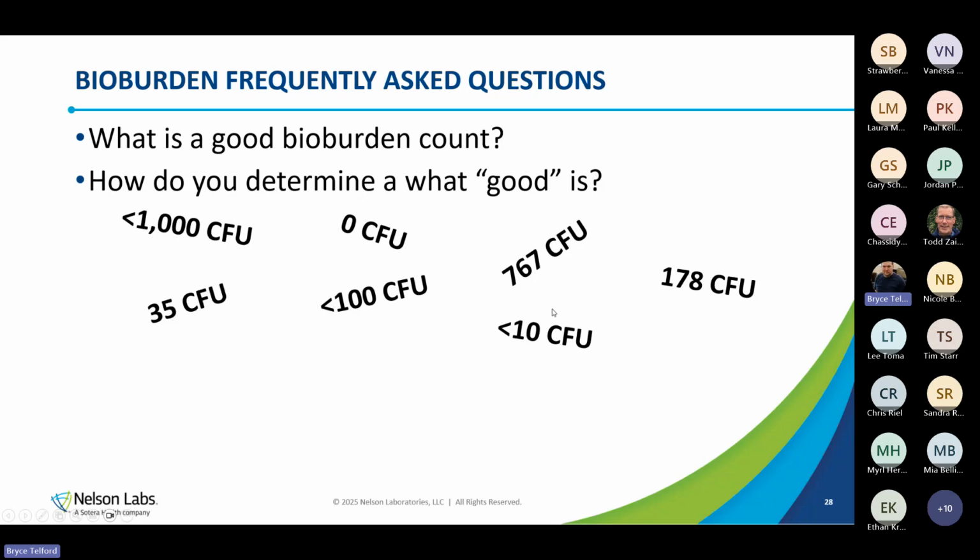The thing is, us as the lab, we see the whole range when it comes to bioburden. I've seen products that we'll put in the MPN test, 10 out of 10 are negative for growth, and that's the bioburden test. It's coming to us essentially with no microorganisms on it. We've also been asked to test a septic starter before, and that required many, many, many serial dilutions and was well in excess of 10 million colony forming units.